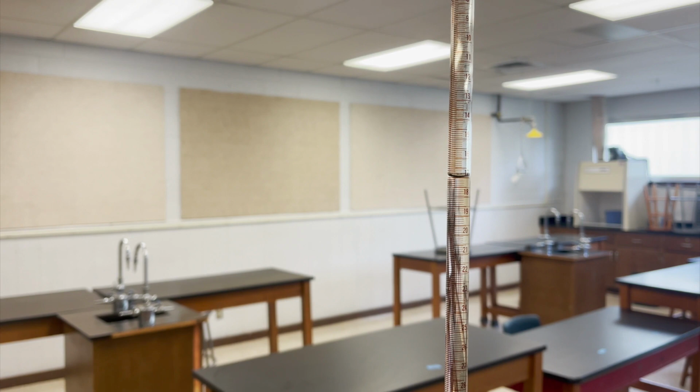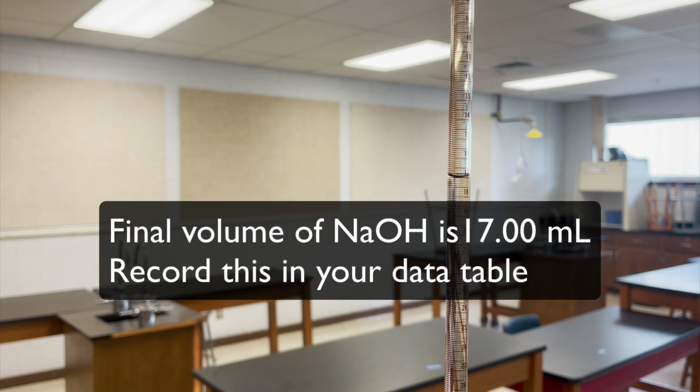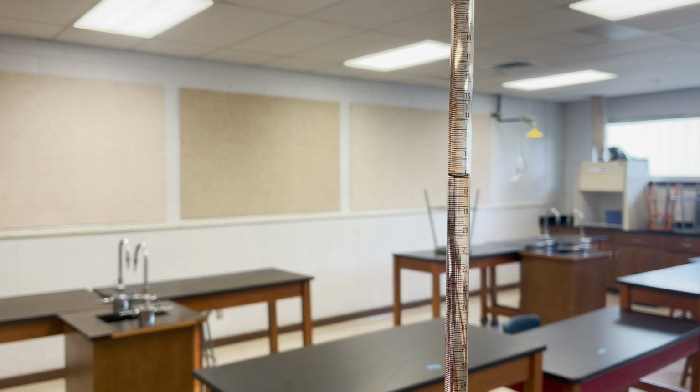If you take a look here, it's at 17 milliliters. And so it took 17 milliliters to get to the point that it turned pink and stayed pink. Now, go ahead and record the 17 milliliters inside of your data table. And from this information, you should be able to determine how much aspirin is in fact inside of there.